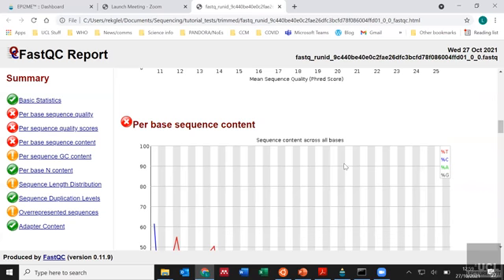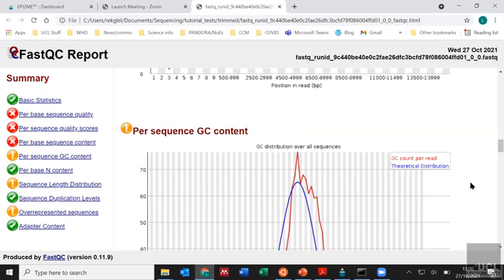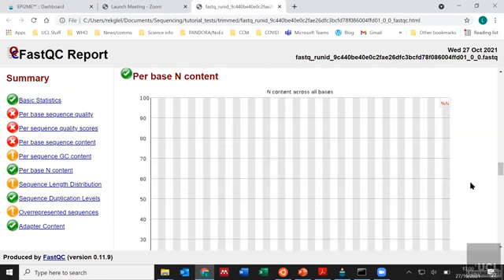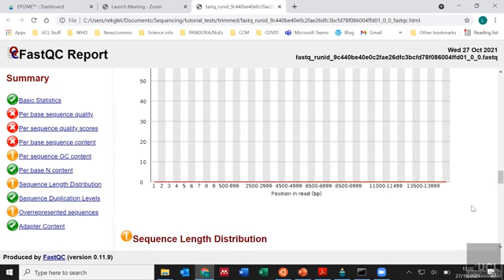Obviously there's more G's and C's, but at the beginning, the first few, it's a bit all over the place, but usually at the beginning and the end of sequencing, it's a bit dodgy because it starts to identify what it is, but generally that's fairly uniform. Then GC content, and then N's. If it doesn't understand what the base is, I think this is more for Illumina because I'm not sure that Nanopore does this, but it's got no N's where it doesn't understand which base it is.